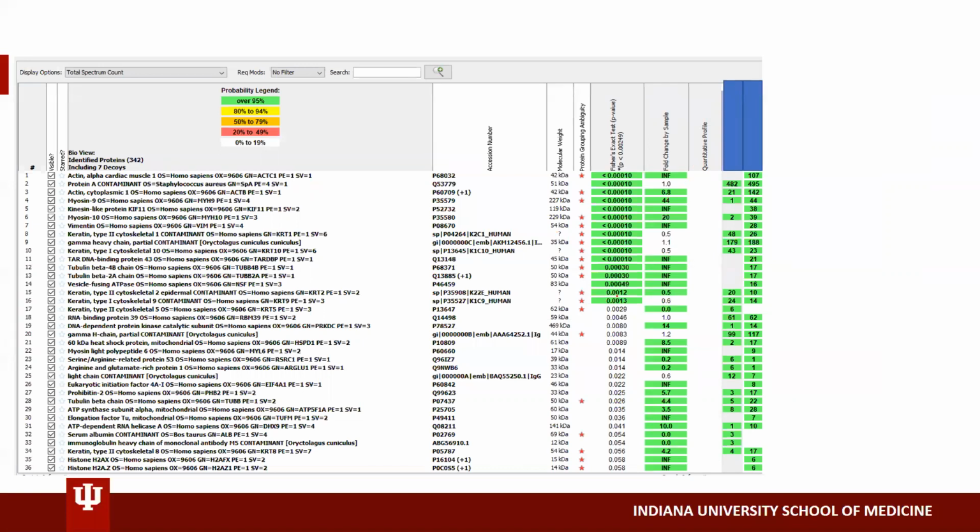And so this is an example comparing 2 samples pulling down a protein of interest. And then you're looking for significance. And so again, this is not an optimized system by any means, but you would hope that in your pull down of interest, you have significantly increased your protein of interest. So it would have 28 versus none in a control setting. So this is the sort of results that can then be exported into an Excel table and played around with. But yes, this is a simple, quick way to do some quantitation if you don't have too many replicates and don't want to pay for TMT or SILAC labeling experiment.